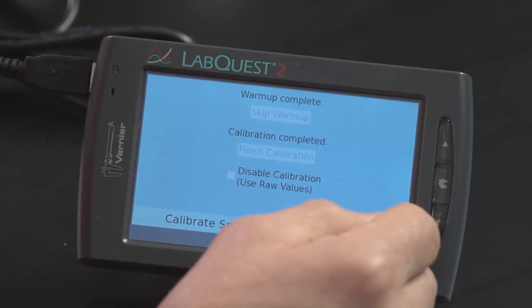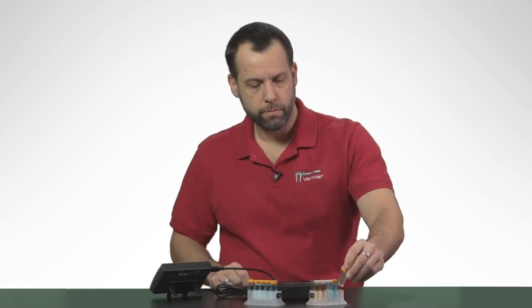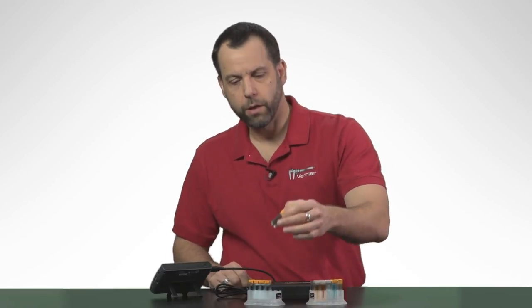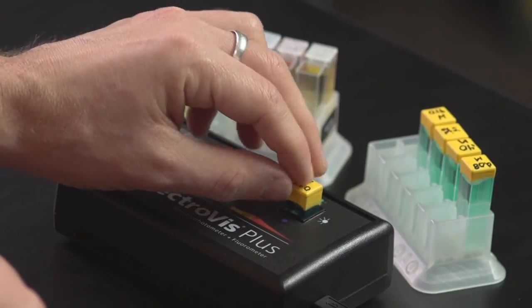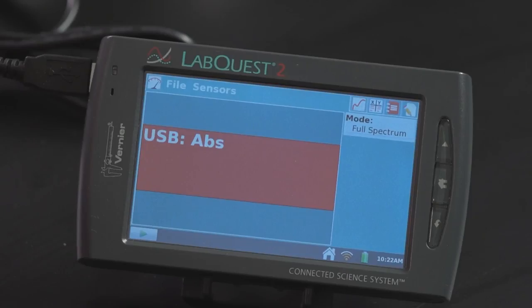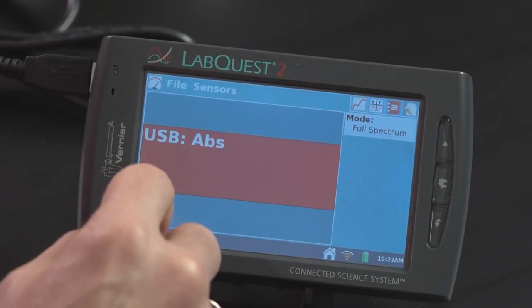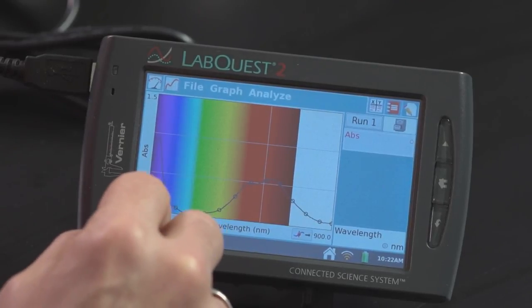Then I hit the OK button and now I'm ready to look at a sample. So let's take a look at some nickel sulfate. I'm going to put it in the spectrometer, and all I have to do to look at the entire absorption spectra of nickel sulfate is click this little collect button.